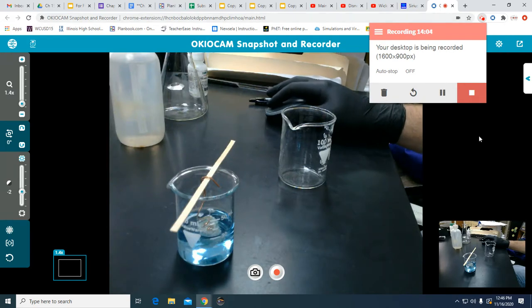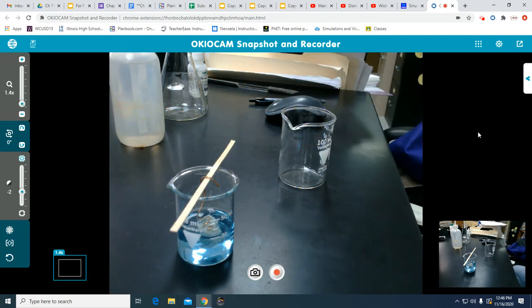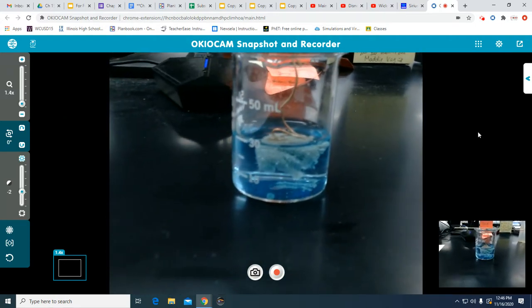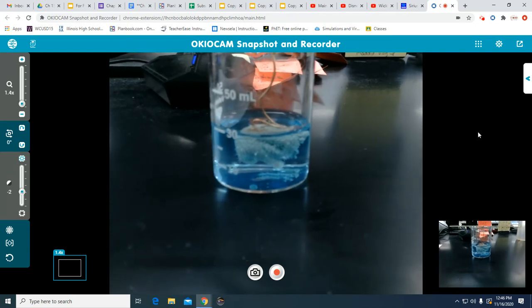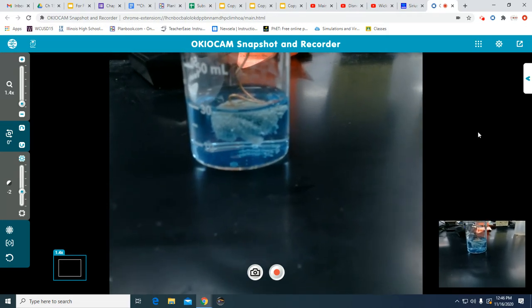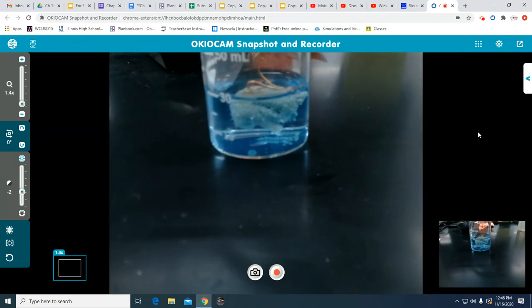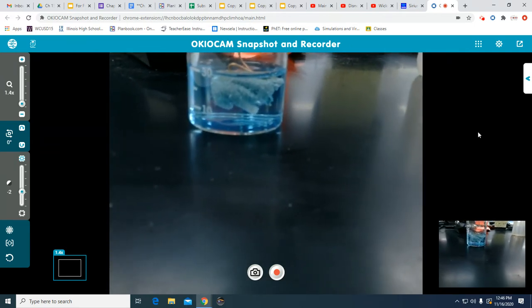All right, we are back, folks. It's been 15 minutes since we started this reaction. I'm just giving you a swing of the camera here. You can see the solution is really blue, meaning that the copper from the copper wire has been replaced with the silver. So those copper ions have actually been moved over into the liquid, and that's why you're getting this blue color, because copper in a solution typically turns a solution blue.